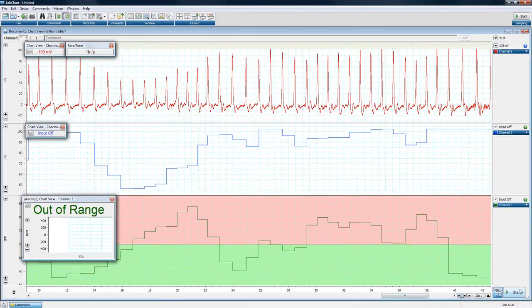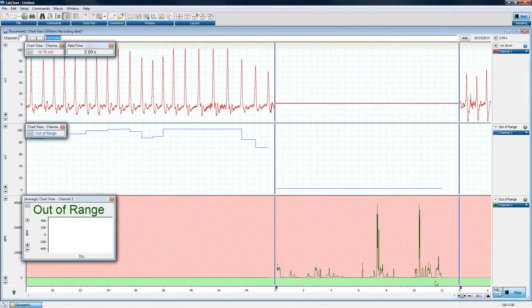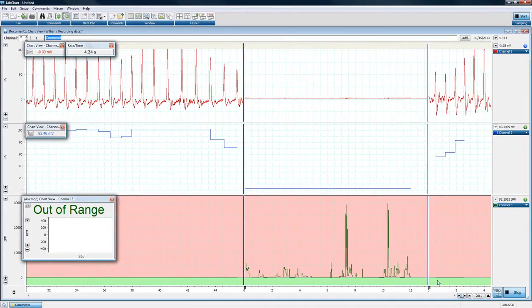But as I record new data, I'll start to record some data here so that you can see how this works. That DVM will only update every 10 seconds because that's what I told it to do, and it will plot the last 30 seconds of data.